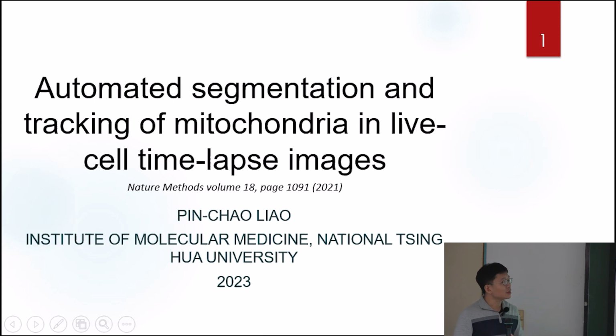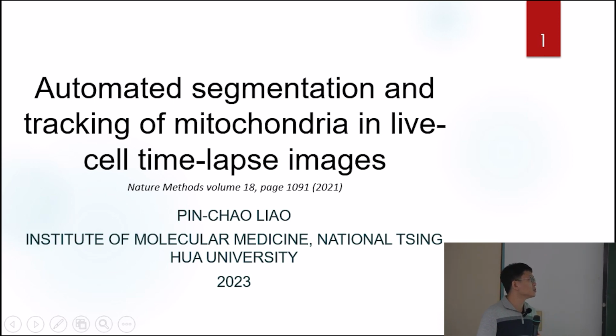In today's lecture, I will give you a brief introduction to mitochondrial dynamics. Then I will show you some methods previously developed for mitochondrial analysis. Then in the final part, I will introduce this paper.